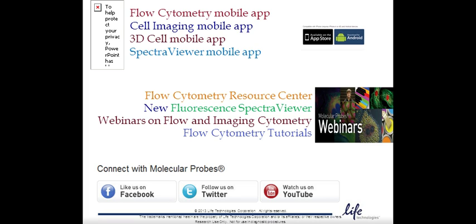There was another question about the application of side population. Human and rodent stem cells efflux both Hoechst 33342 and DyeCycle Violet stains, and that's the basis for the side population technique.